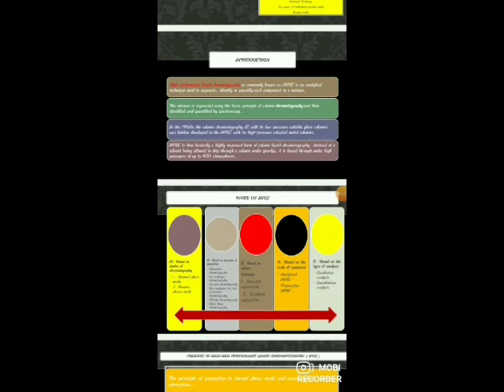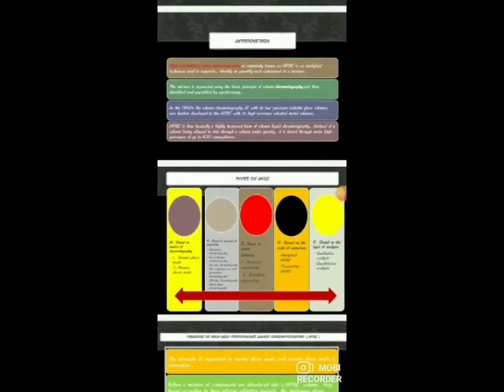Now this method was first proposed by Kirkland and Huber. They proposed a high pressure system capable of operating at pressures up to 1000 psi. So generally HPLC is basically an improved form of column liquid chromatography. Instead of a solvent being allowed to drip through a column under gravity, it is forced through under high pressure of up to 400 atmospheres.